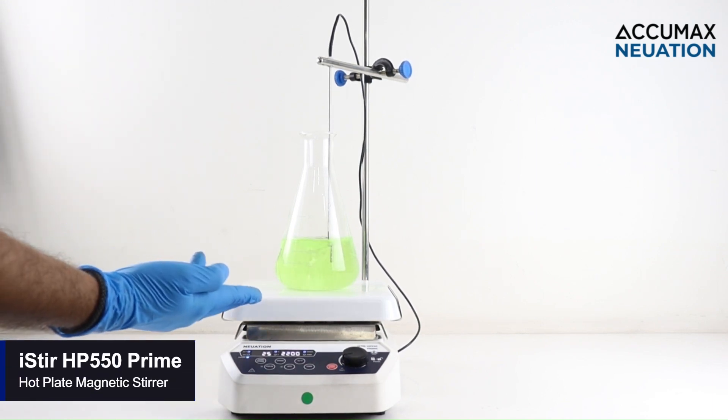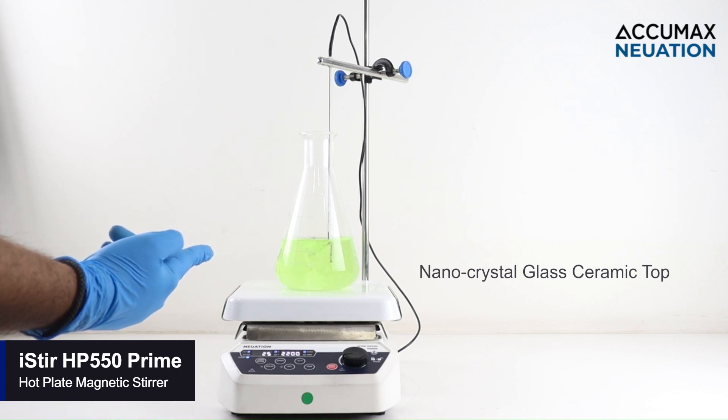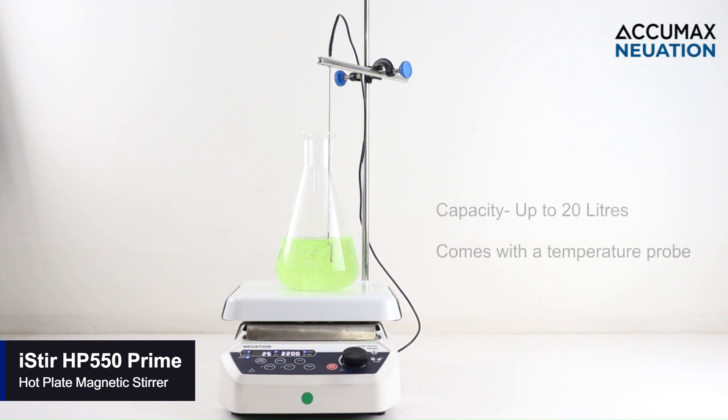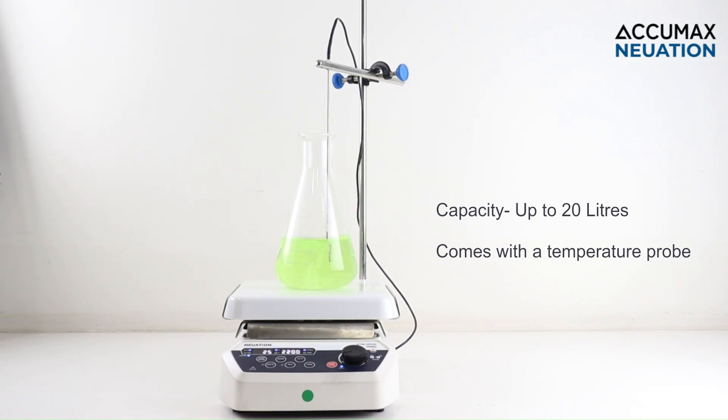The HP 550 Prime has a nano crystal glass ceramic top plate that ensures high chemical resistance and uniform heat transfer for homogeneous mixing. This machine has a compact design with a capacity up to 20 liters and it comes with a PT 1000 probe.